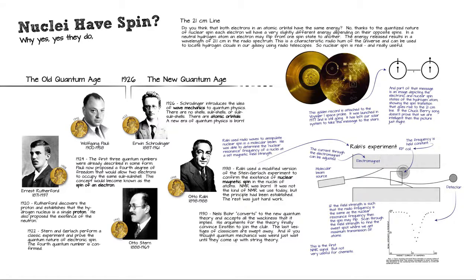So he kept the frequency constant here, and he changed the power of the magnet slowly by changing the current. As you change the power of the magnet, the resonance frequency increases with magnetic force. So when you have enough magnetic force that the resonant frequency is exactly the same as the frequency being emitted by this RF coil, you'll flip some spins, and there's his famous graph right there.